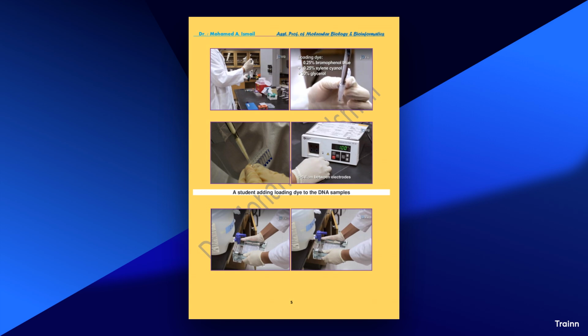5. Errors in data analysis. Misinterpretation of bands. Error: incorrectly analyzing band patterns, such as mistaking primer dimers for target products. Impact: this can lead to false conclusions about PCR success or specificity. Solution: compare band sizes to a standard DNA ladder and consider running controls for accurate interpretation.